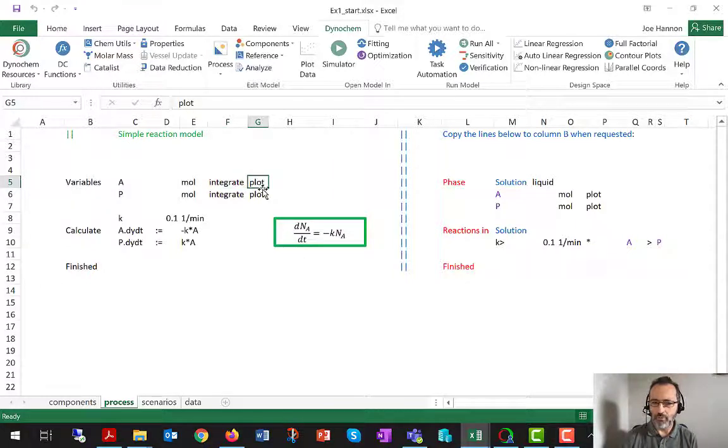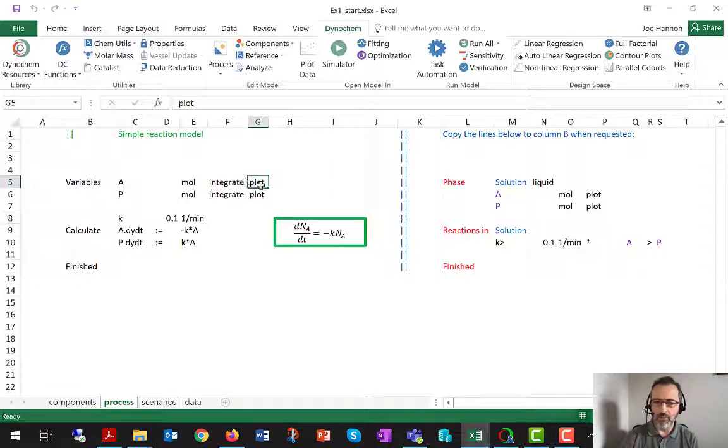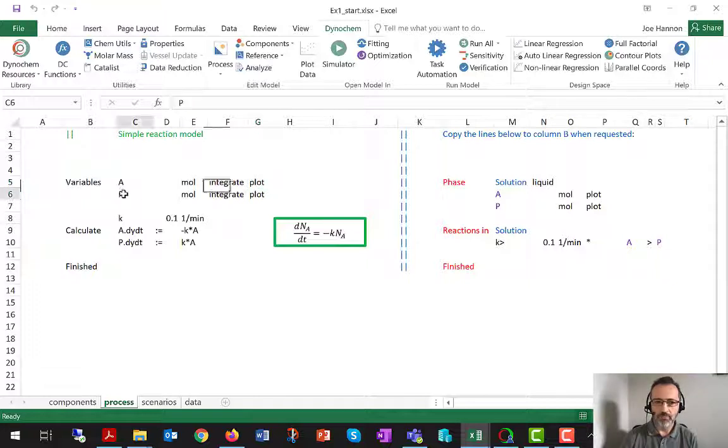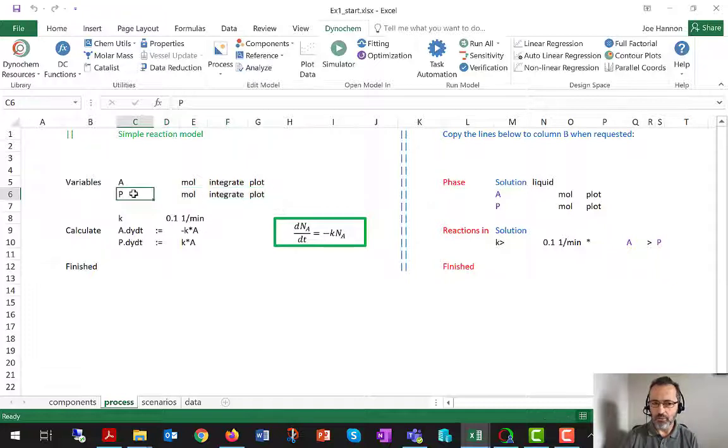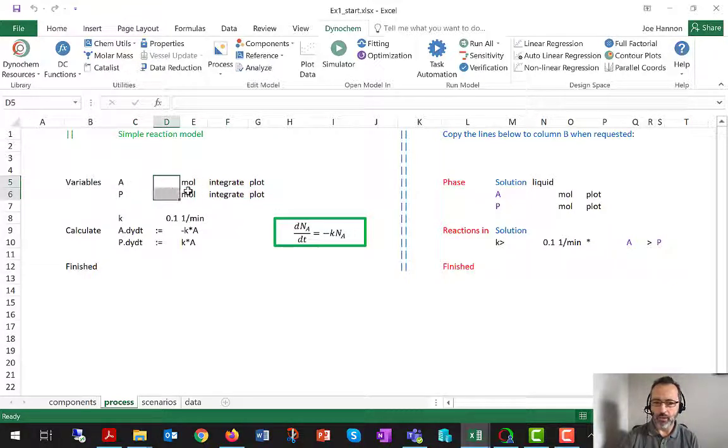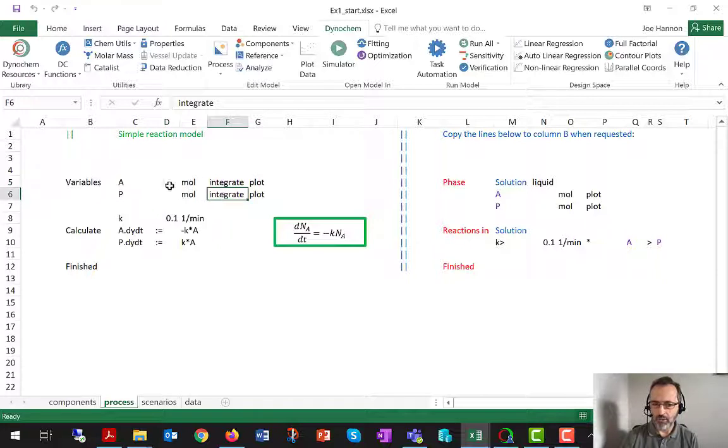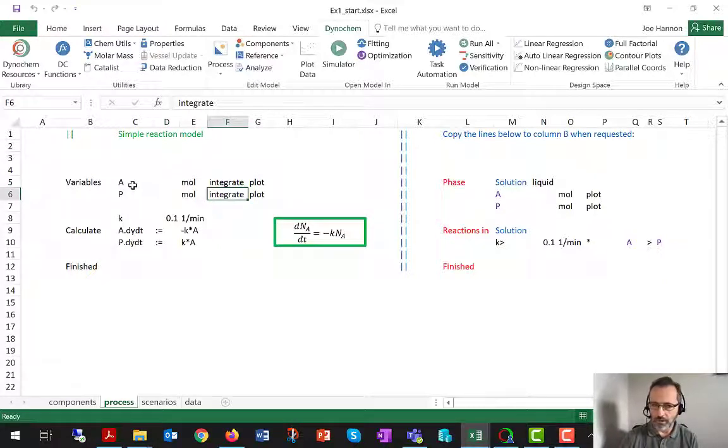And then we have the plot keyword. This can be either side of integrate, but I think you already know well what this does. Then we have a copy of that row for the product P. Again, a blank for the initial value, and then integrate so that we will be calculating DPDT.